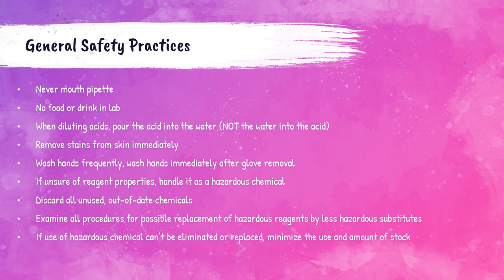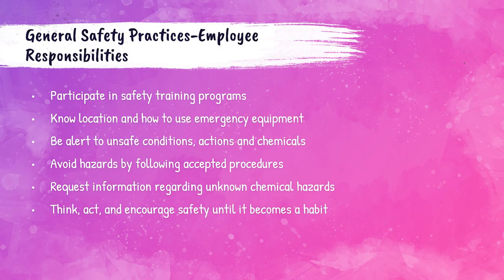Procedures should be reviewed regularly to determine if hazardous reagents can be replaced by less hazardous substitutes. If hazardous chemicals cannot be replaced, their use and the amount of stock kept in the laboratory should be minimized. Employee responsibilities for staying safe include participating in safety training programs, knowing the location of emergency equipment and how to use it, being constantly on alert for unsafe conditions, following laboratory procedures to avoid hazards, and requesting information regarding any unknown chemical hazards.